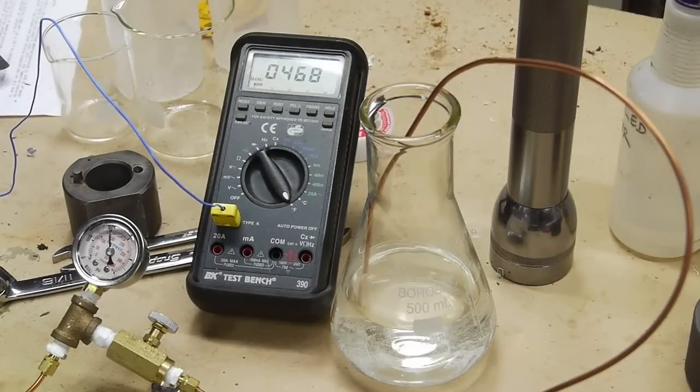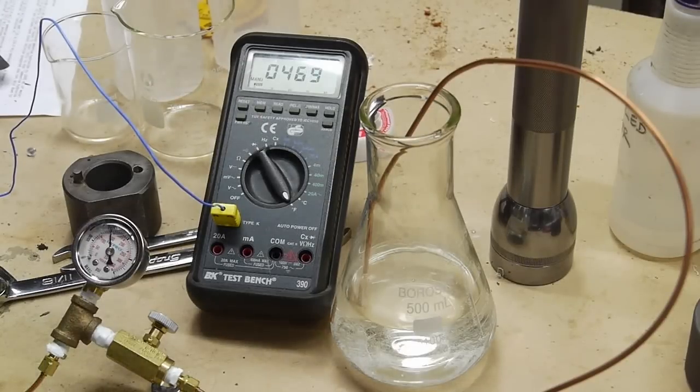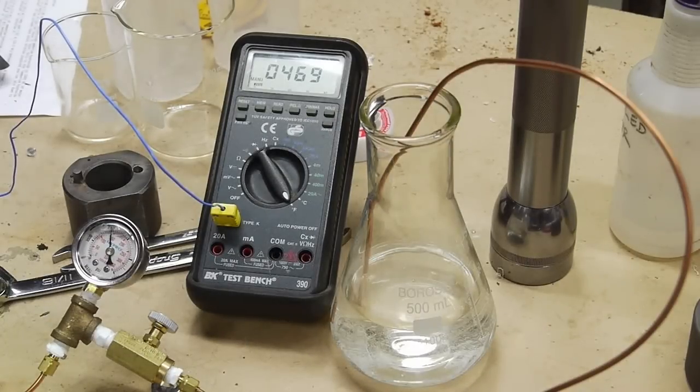After I reached the critical point, which is 460 degrees F at around 1200 psi for methanol, I started releasing the pressure and continued to apply heat to keep the temperature above 460 and allowed the pressure to come down slowly.